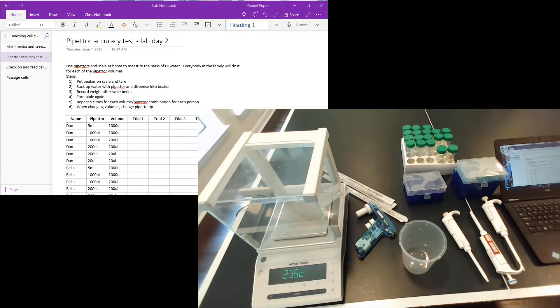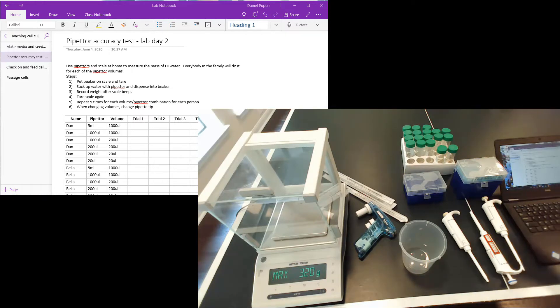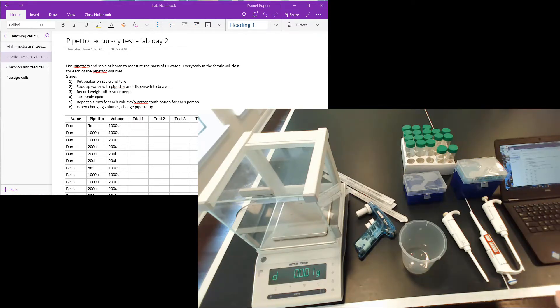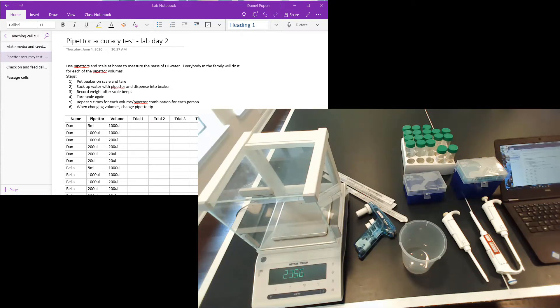I'm going to collect measurements and show you how to do it. I'm not going to show you every repetition, but I'll just show you the process and then you can see how we do testing for these pipetters.